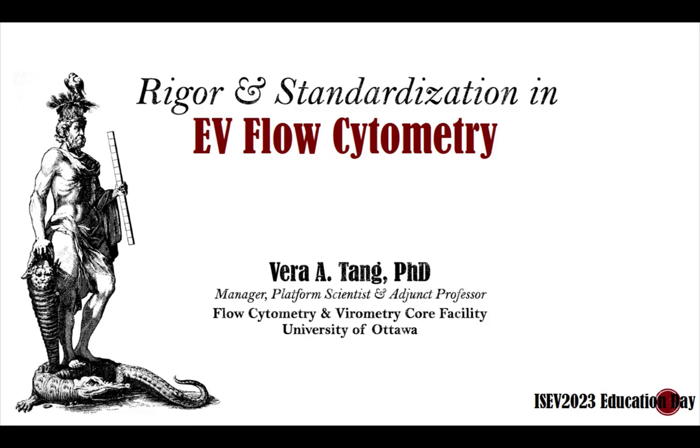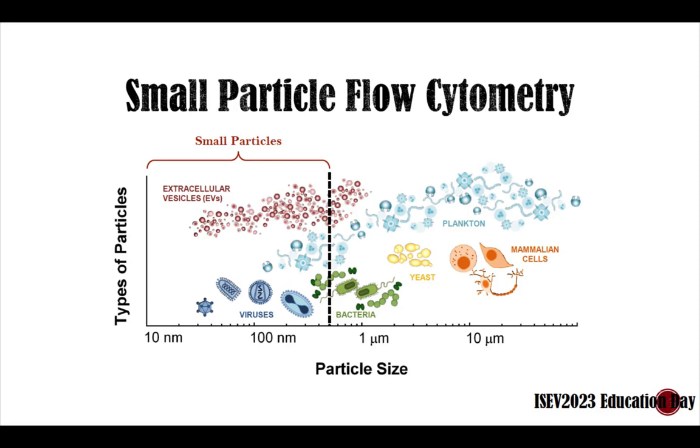This is how I stumbled upon meeting these guys like Edwin and John and Josh, because I was interested in looking at viruses on my flow cytometers. And so under the big umbrella of small particle flow cytometry, EVs fit in there, as well as viruses.